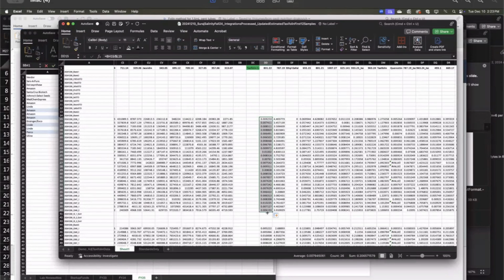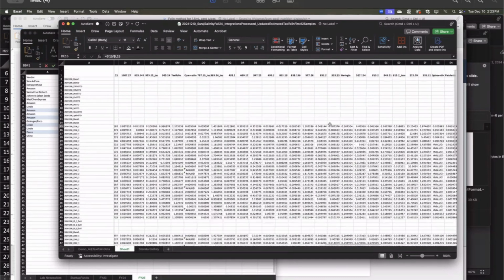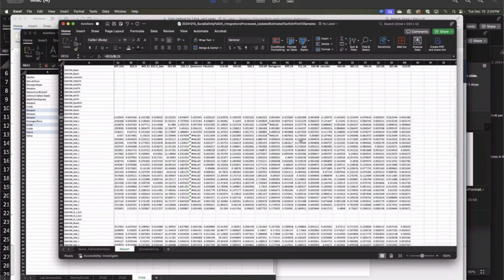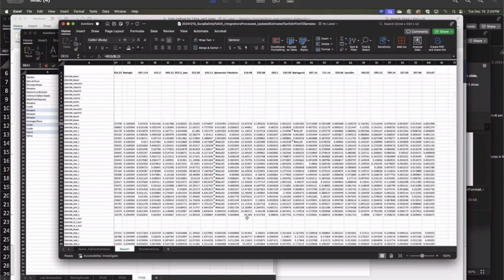non-whole number. So you can kind of see just visually looking through some of the analytes that are larger, they might be like a small whole number, and then other ones, most of them are just kind of decimals. And so this is where we're at in terms of our final peak areas that we can actually use for analysis. And so we have these corrected for both extraction efficiency and instrument variation.